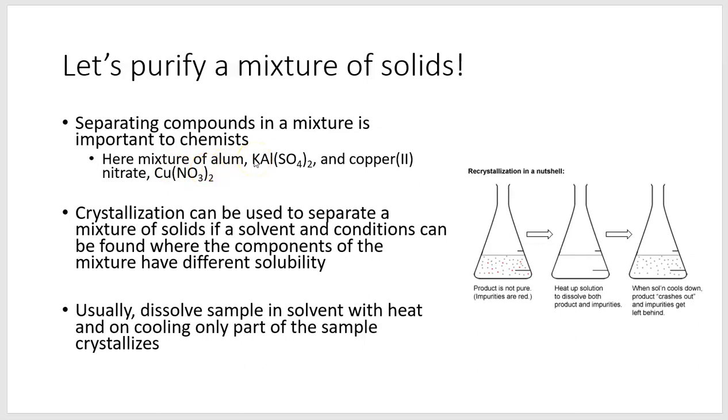Alum is white. And when you look at the initial solid or initial sample, that's a mixture of these two, it's kind of a blue-green. And hopefully by the end we'll have purified a white solid, which should be fairly pure alum.